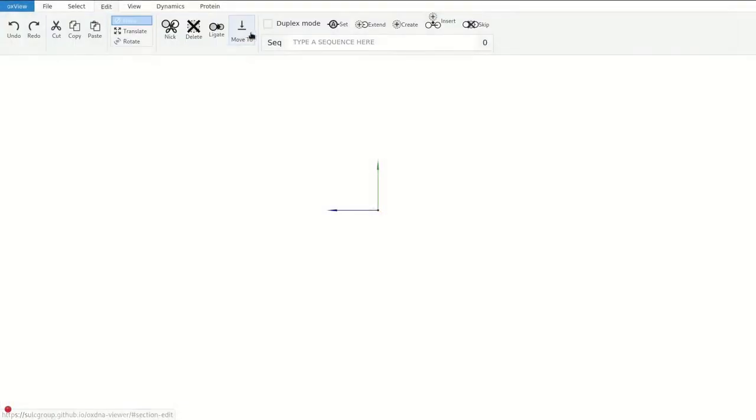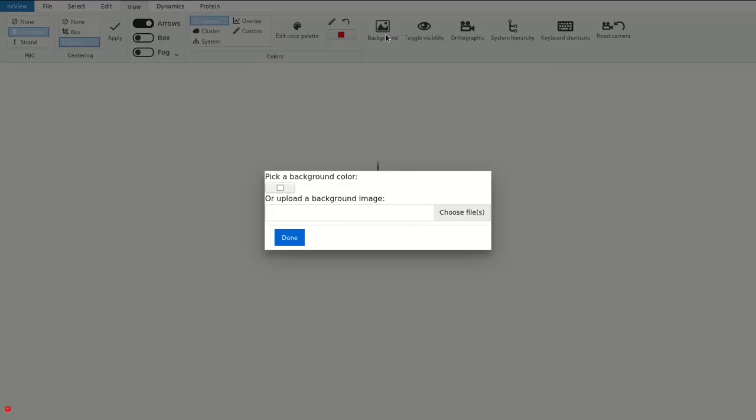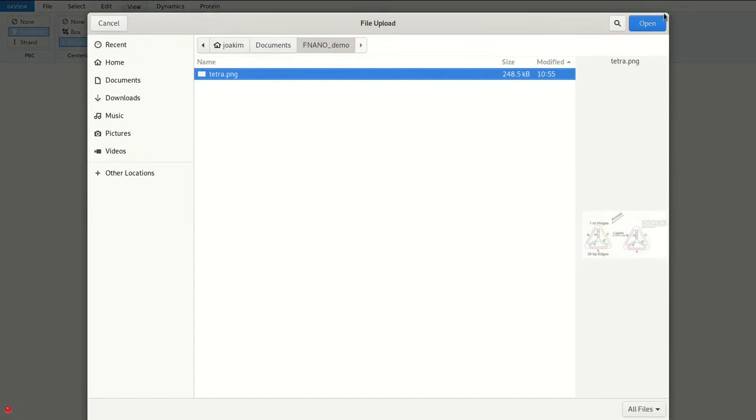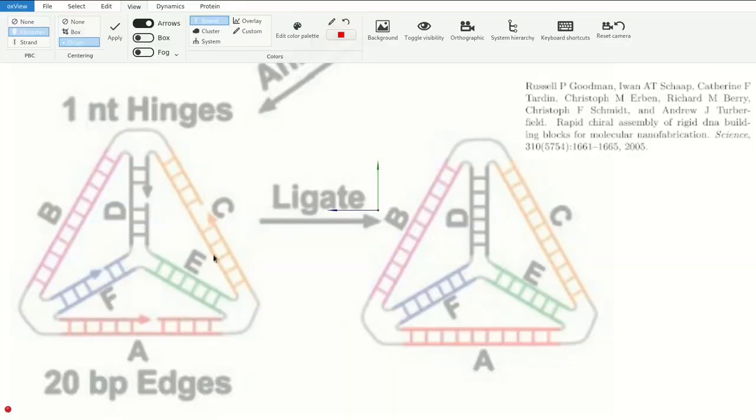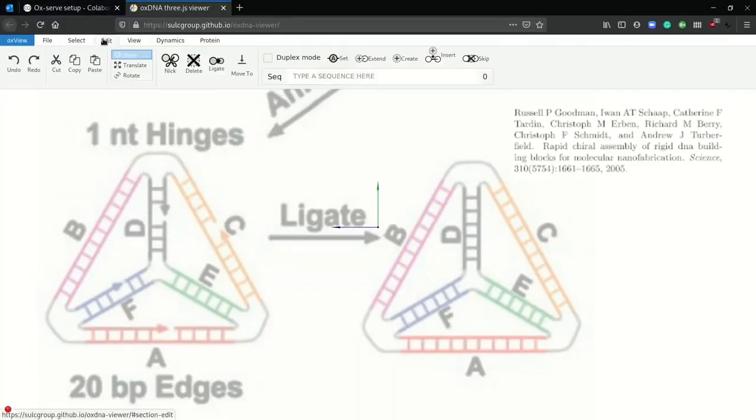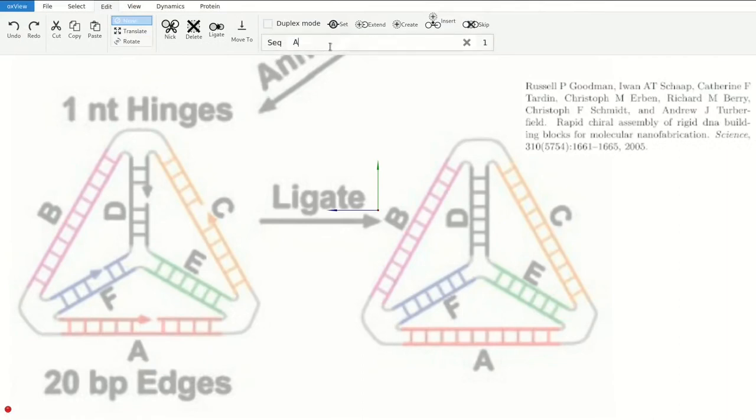To start with, let's load some kind of background image as a reference. I prepared this tetrahedron shape here from the Turberfield Lab in 2005. You can see that there is a 20 base pair edge on each side, and therefore we will start by creating a 20 base pair helix.